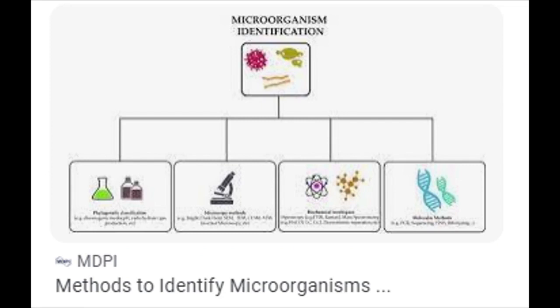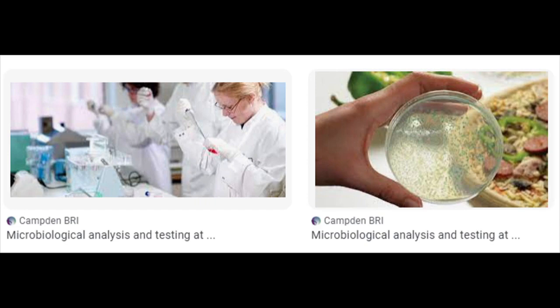Then apart from ATP, you have others. Then we have the immunological methods, which are also called rapid again. So we look at that, and then DNA, RNA is also there.